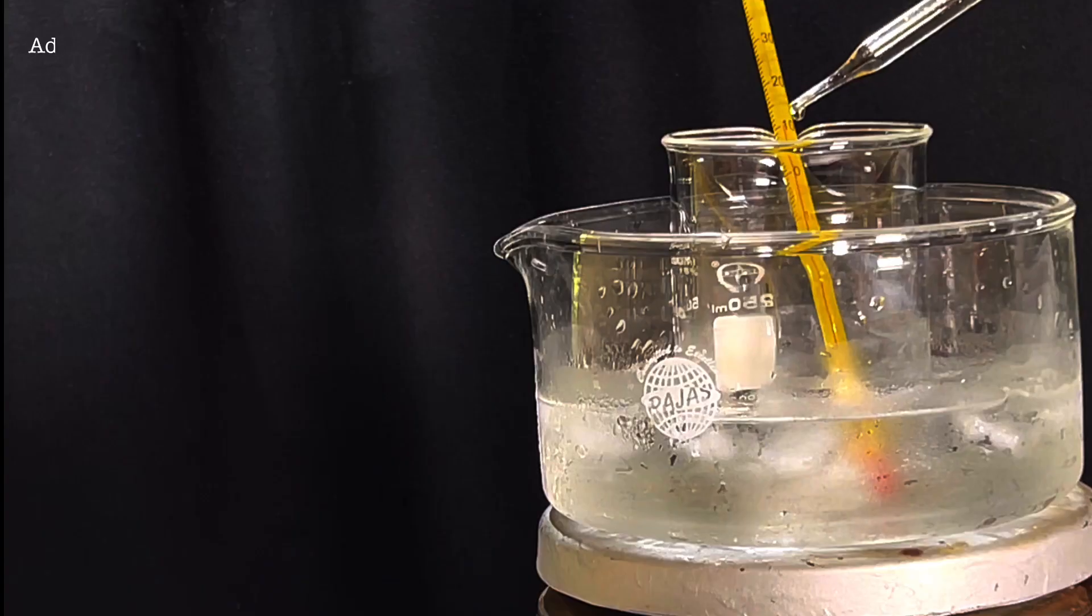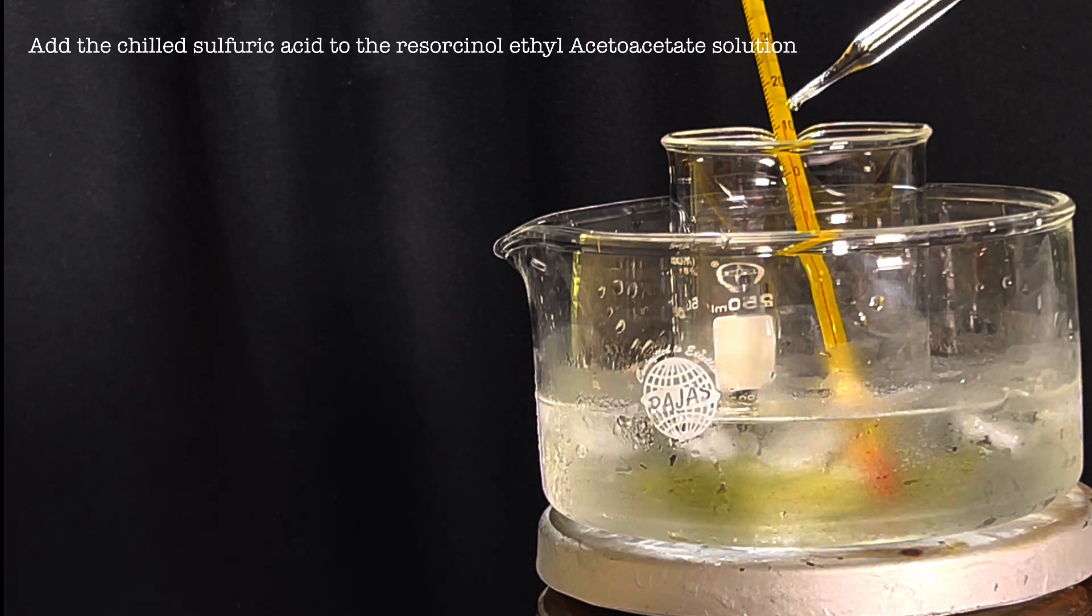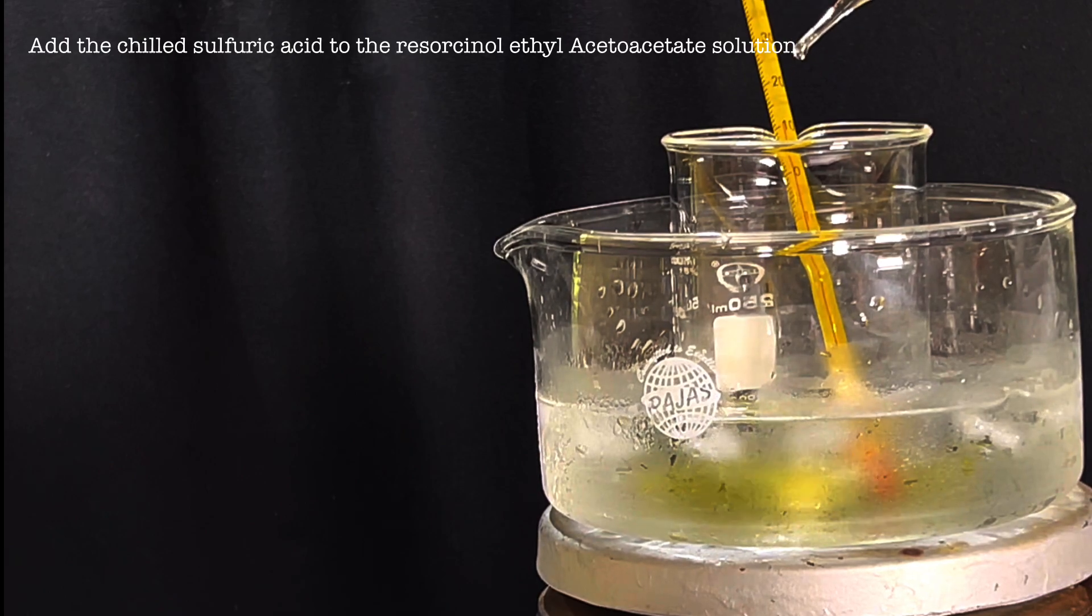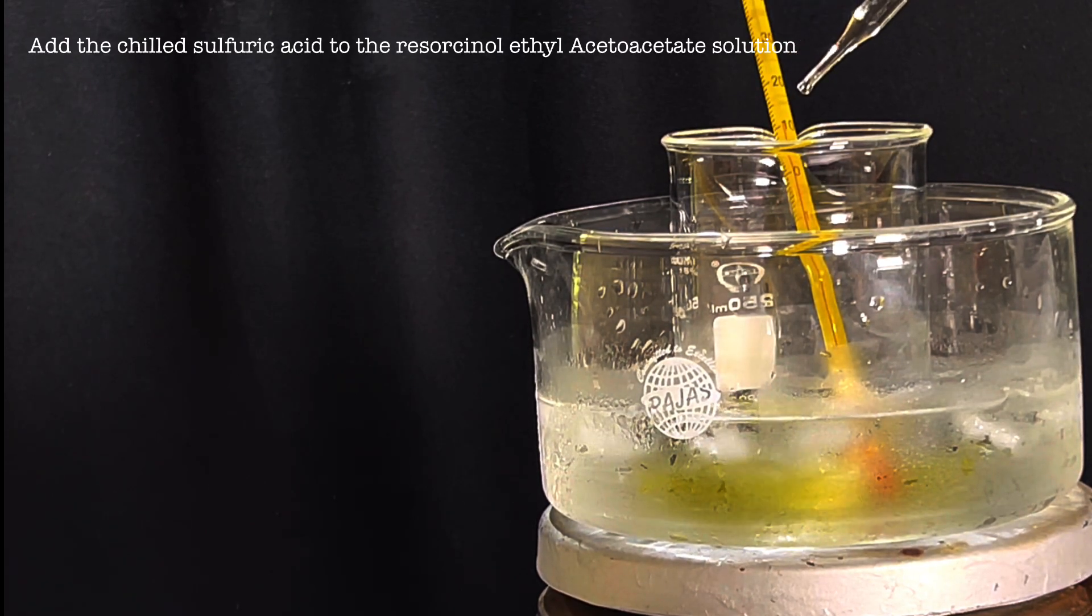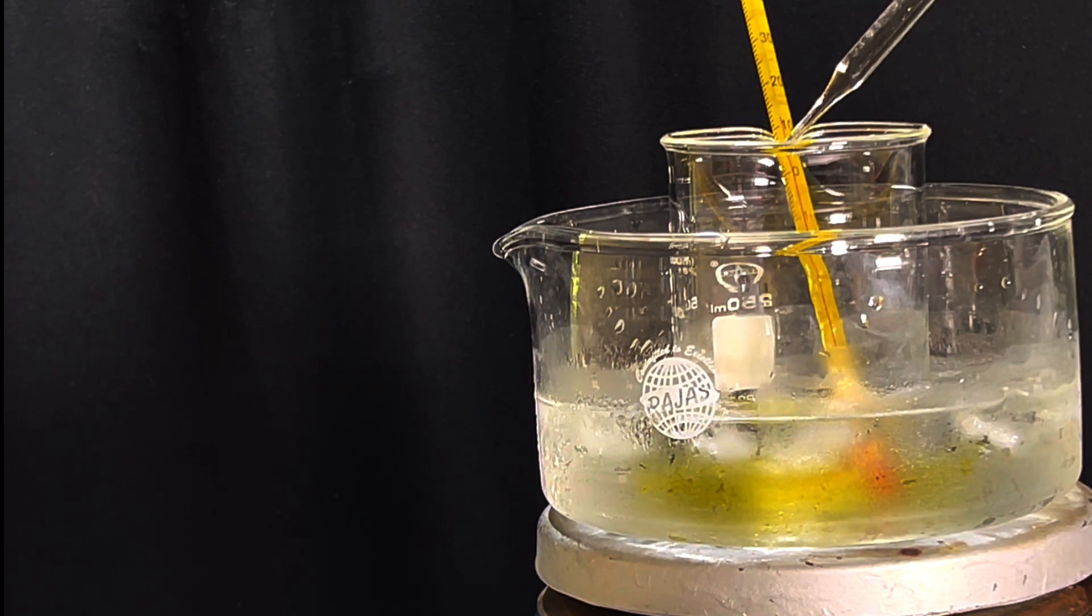Then the solution in the flask is added dropwise to the chilled sulfuric acid slowly using a glass pipette. Addition of resorcinol ethyl acetoacetate mixture to the sulfuric acid is exothermic. A thermometer was placed in the beaker and the temperature was maintained below 20 degrees C.